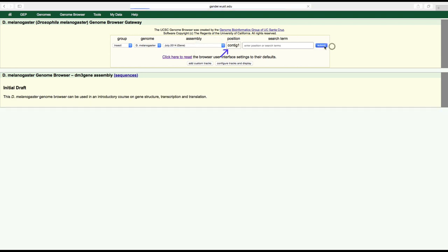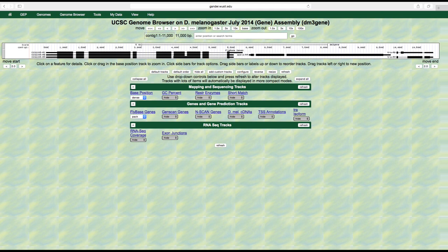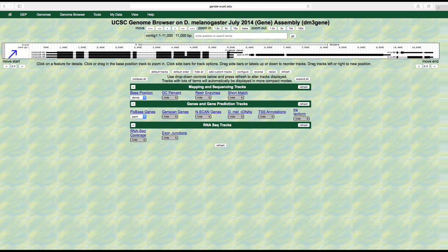We will be looking at contig 1. After we hit submit, we are brought to the view of this region. At the top of this page we see the name of the species and the assembly, and the position should show contig 1 colon 1 through 11,000. This means that we are viewing 11,000 base pairs of the Drosophila melanogaster genome. We can see the base pair numbers along the row called scale.